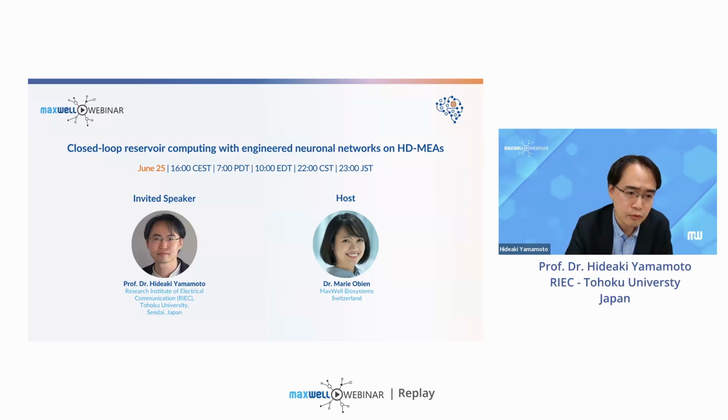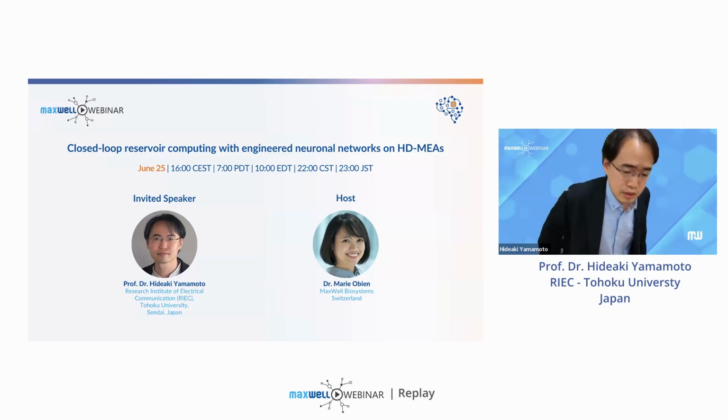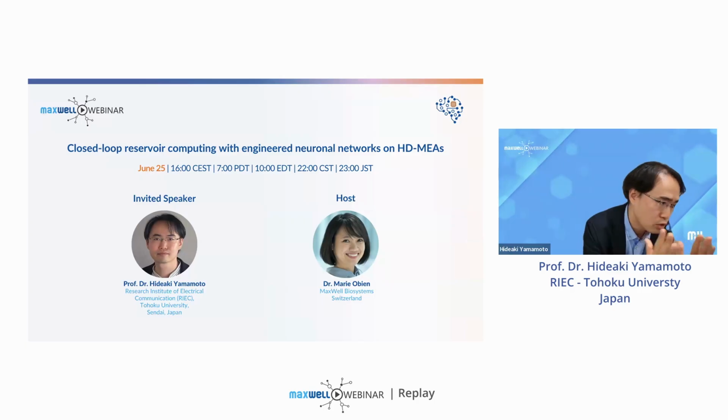Right. So in reservoir computing, it's not always true that higher dimensionality positively correlates with higher performance. If you have dynamics that are too high in dimension, it could be too noisy to be used as a reservoir. But in this case, I guess what's happening is that we're looking at the low dimensionality regime where the higher dimensionality acted positively.